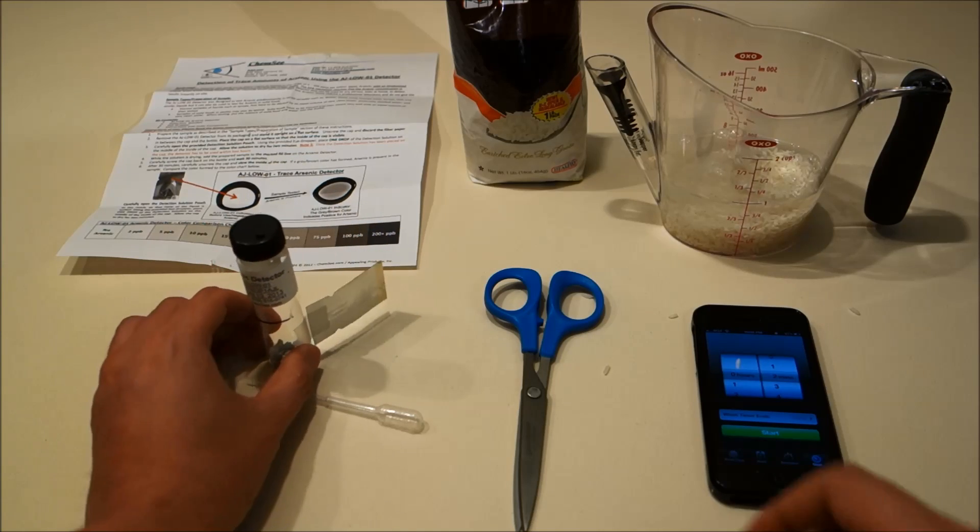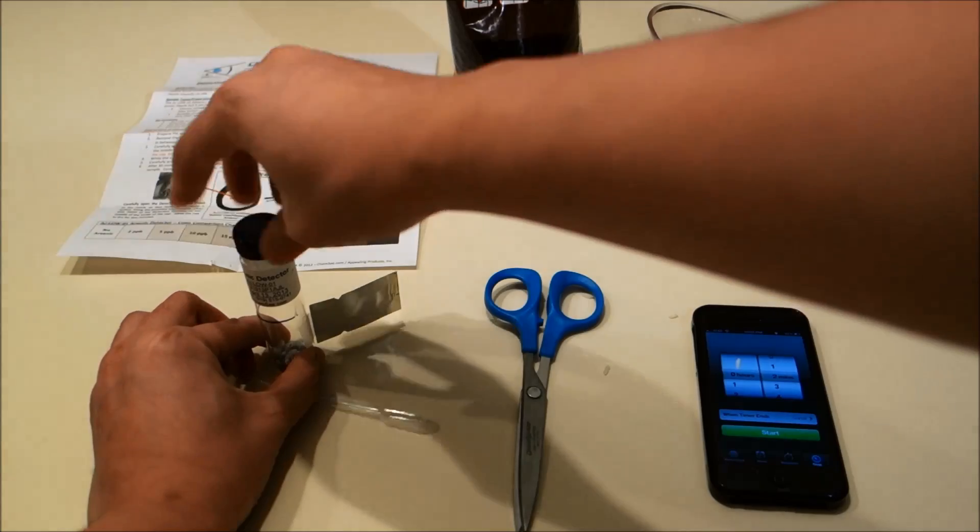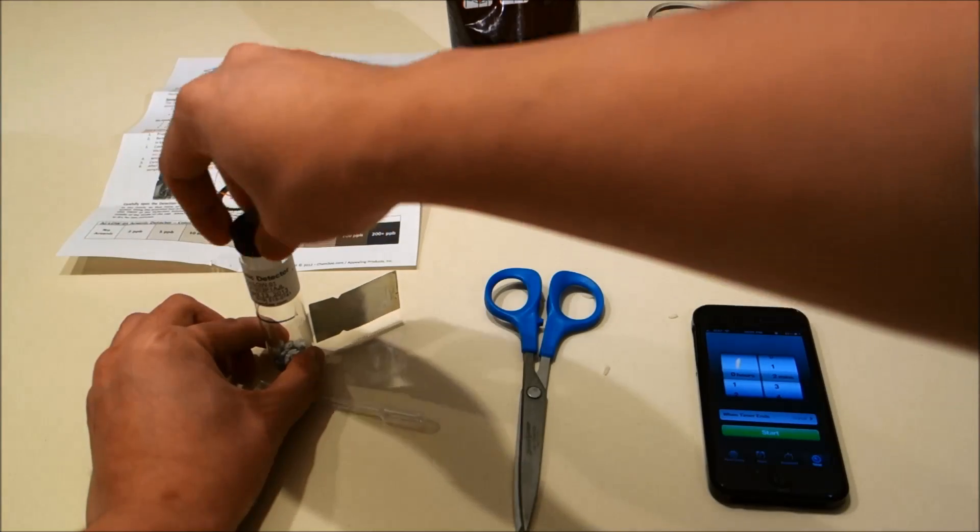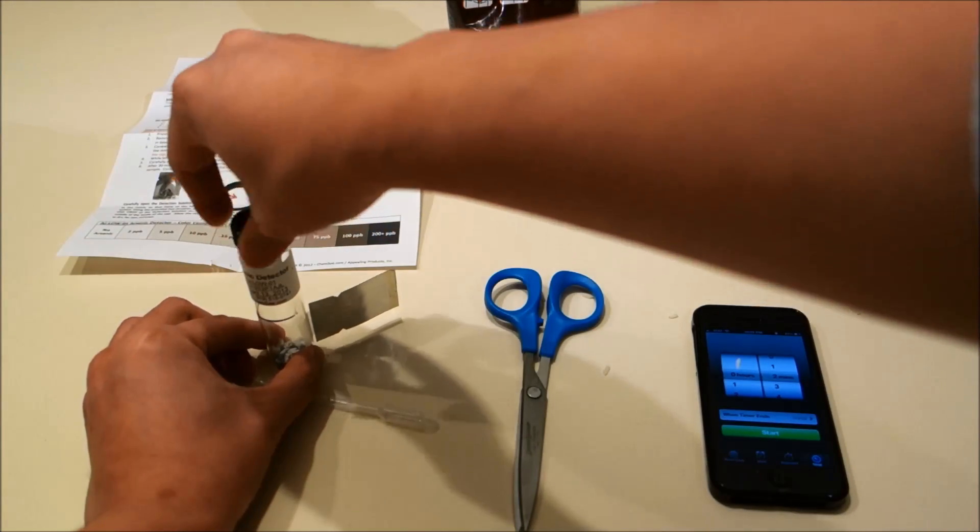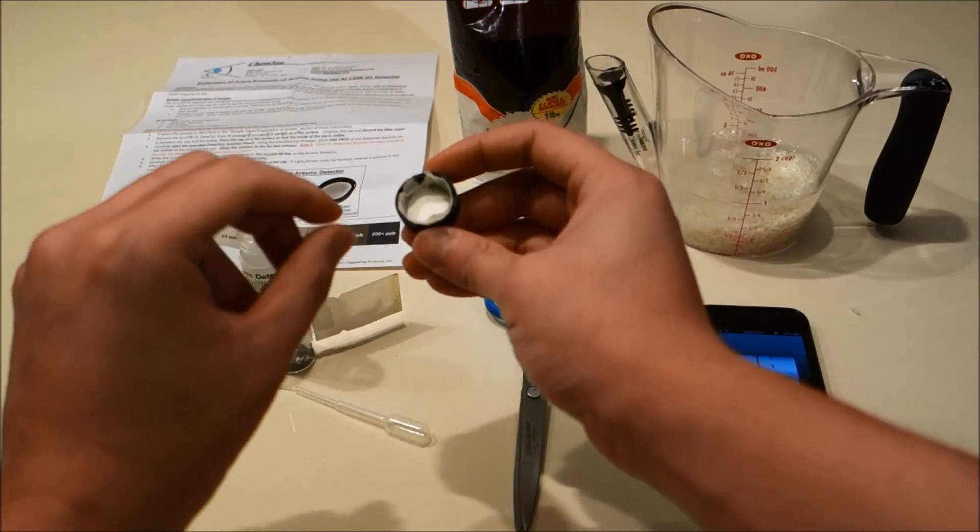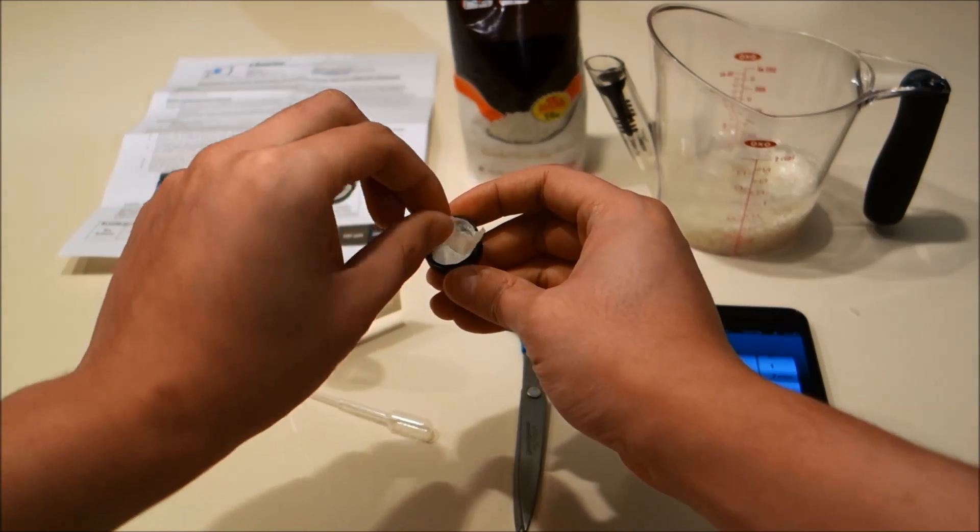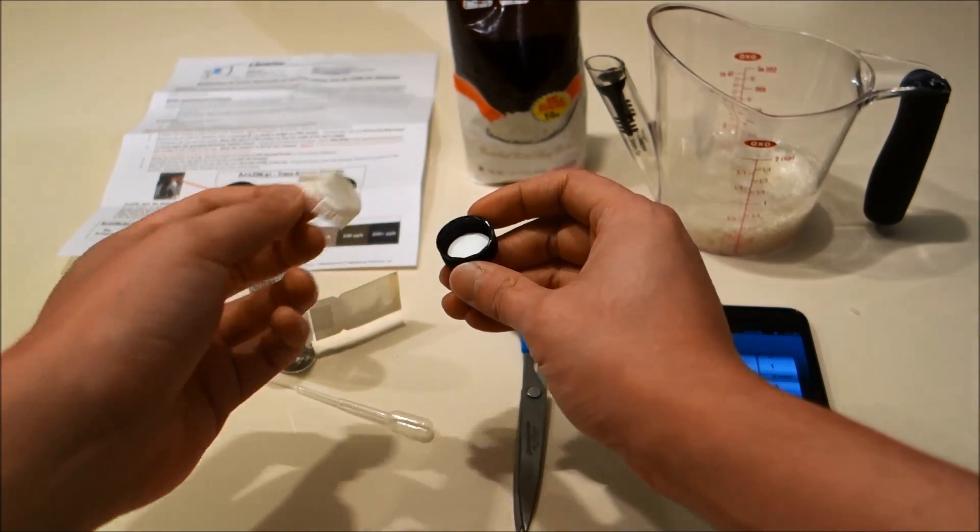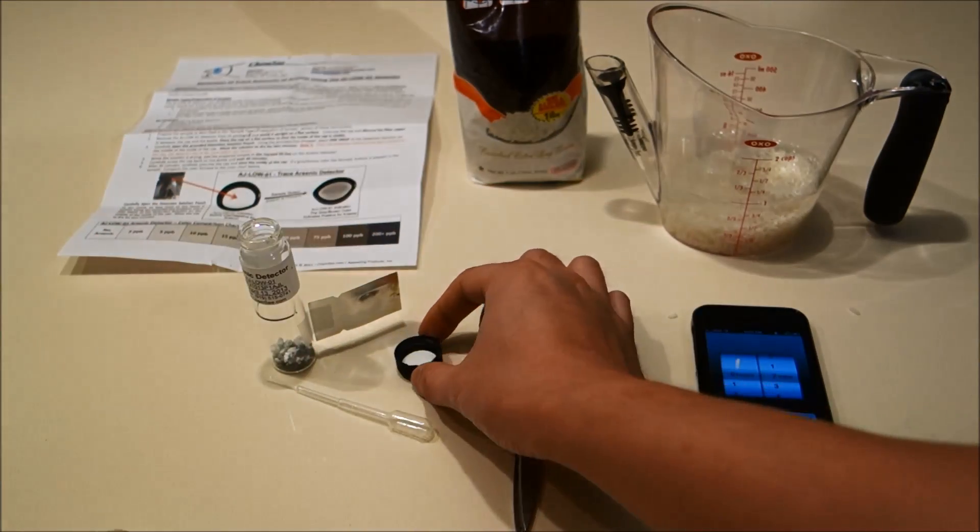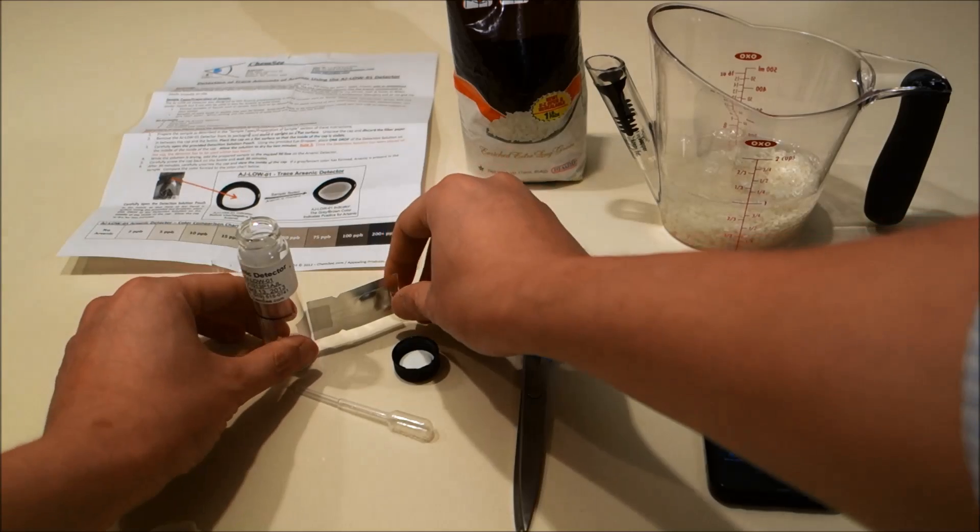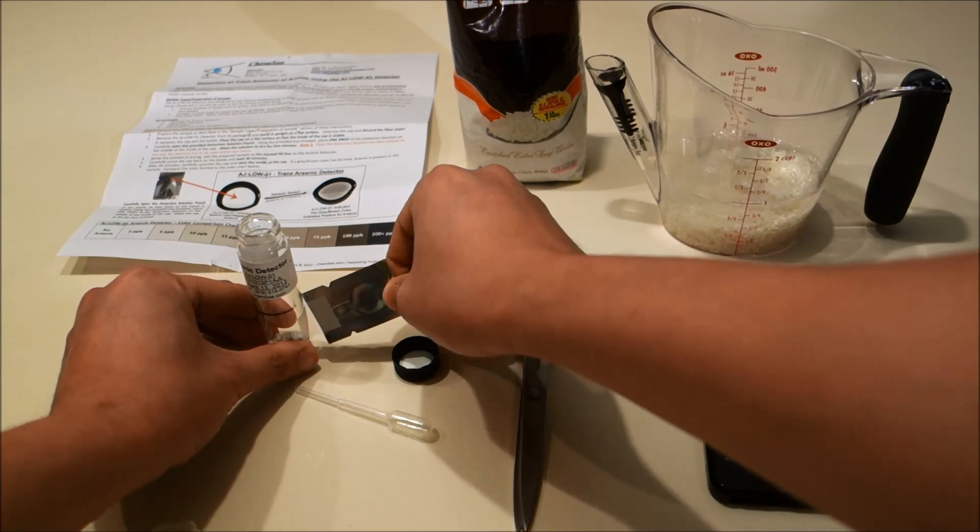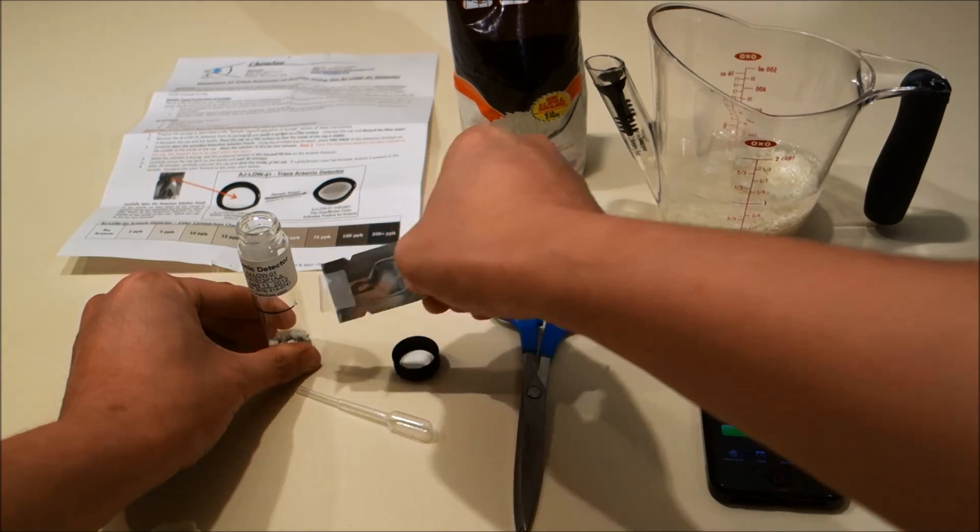So to start, we're going to remove the detection cap from the vial and remove the filter paper that's attached to it. Next, we're going to remove the solution pack attached to the side of the vial.